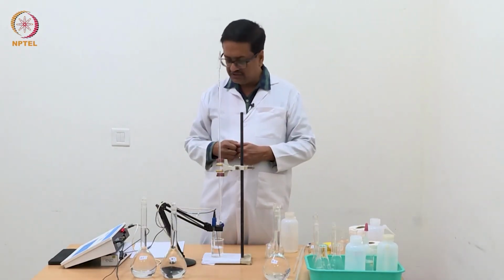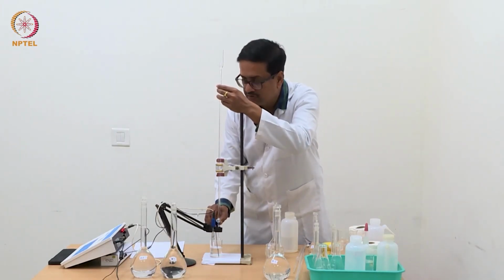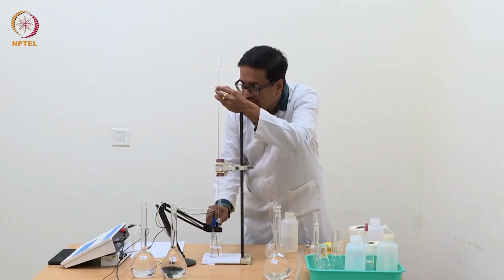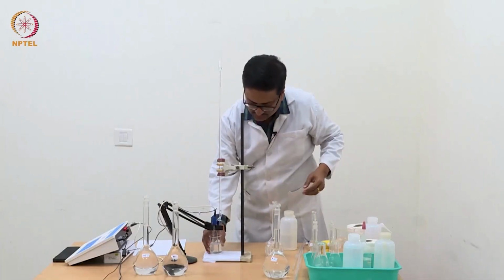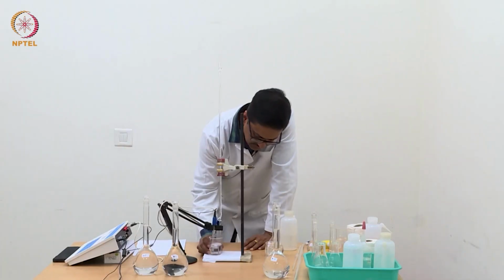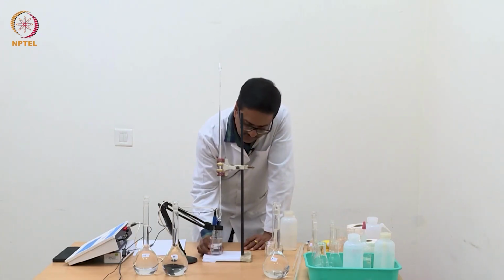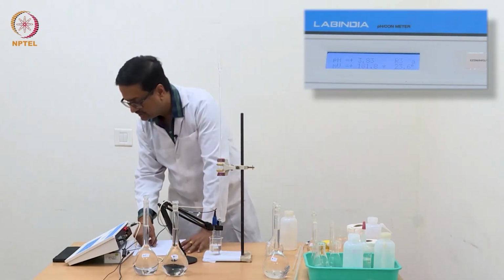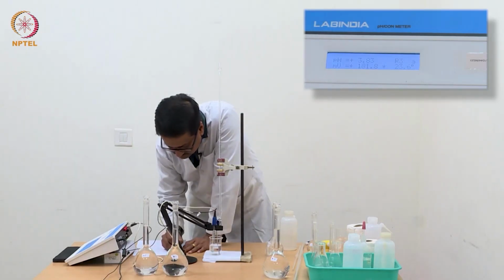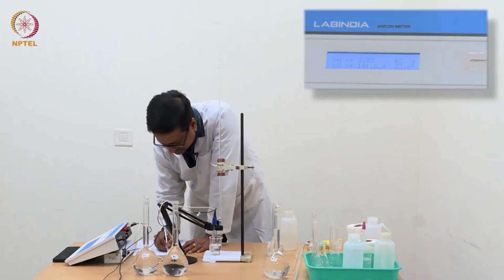So like before, we should continue addition of NaOH each time by about 0.02 ml, very carefully, one drop at a time, and then shake the solution well and let it equilibrate to give you the changed pH after addition of every 0.02 ml of solution. So now it has become 3.83.